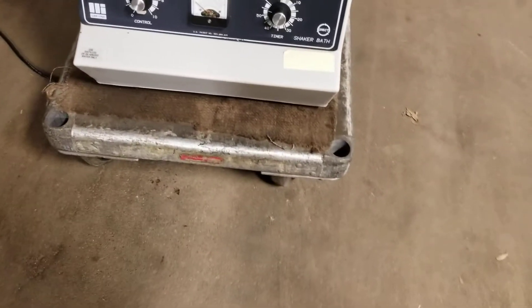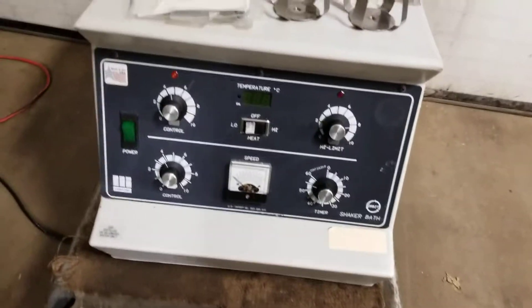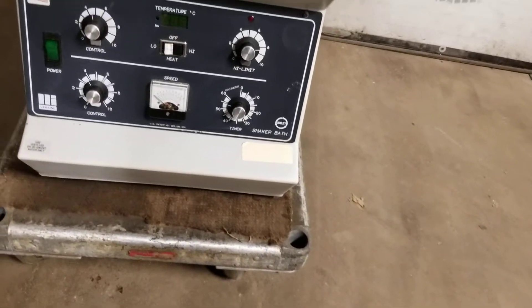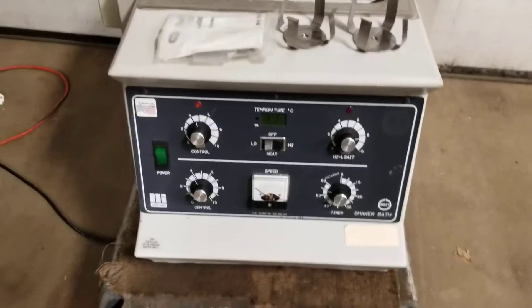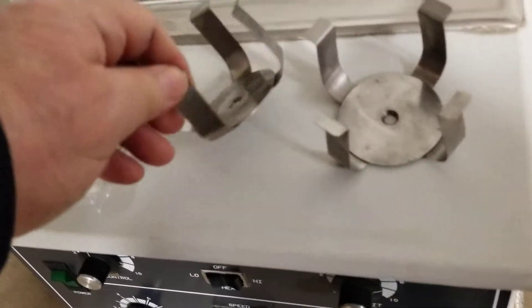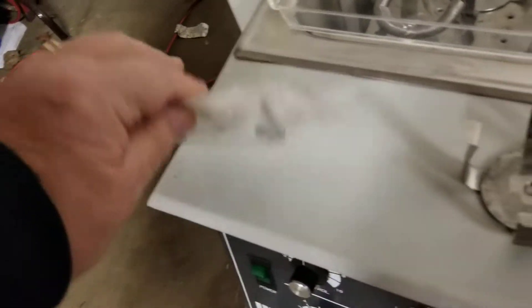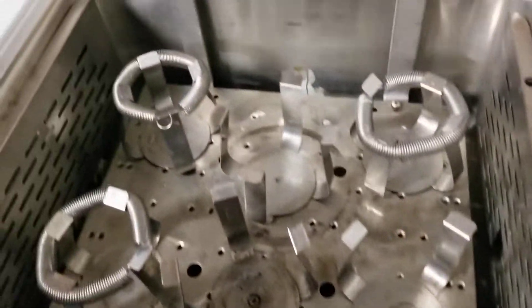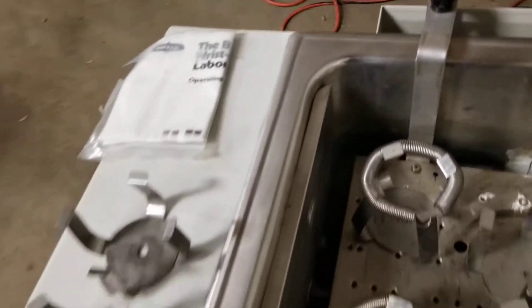You're bidding on a LabLine 3540. This is an orbital heated water bath shaker. It's got a couple extra of these — instructions, I guess. Very nice condition. This came out of the consolidation — lab consolidation of a large pharmaceutical company.